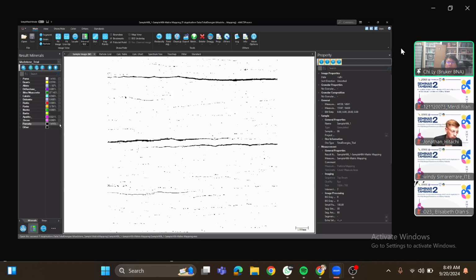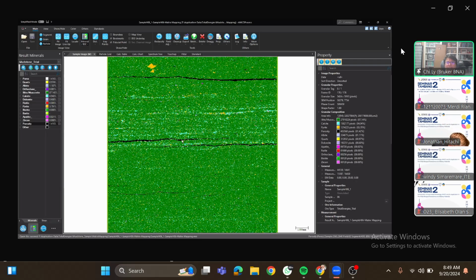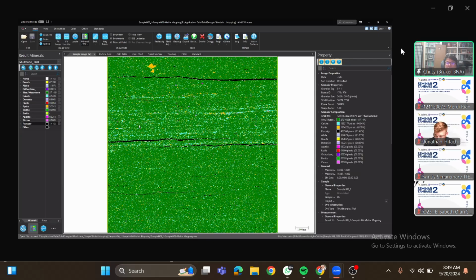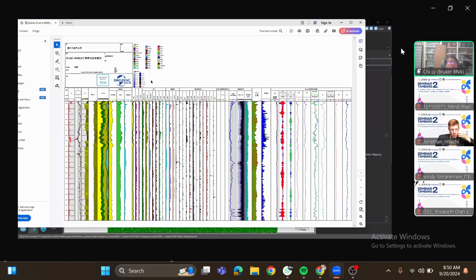One thing a lot of oil and gas people appreciate with AMICS is that because it's a very consistent analytical tool, all the data that you collect from a particular project is compared to the same mineral library, which means you're getting very consistent quantification or characterization of your material. So if you measure cuttings or cores up and down the length, you can generate a very consistent core log. In this case, for example, you can generate a core log like this. And zoom in. There we go.